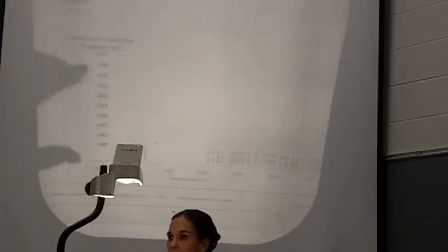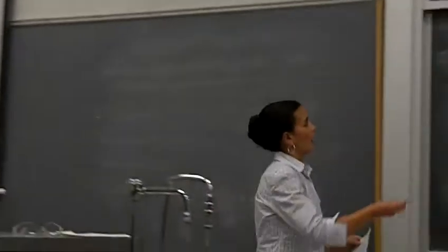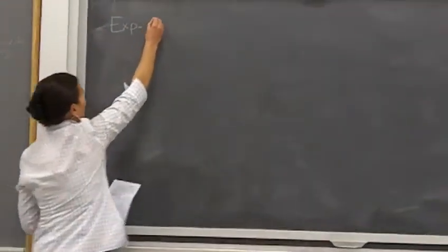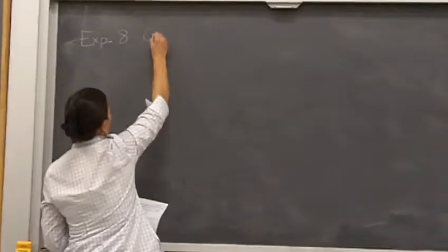So use the peak list for your IR table for comparison, and then compare your IR to what it looks like, but you do not need to print a copy for your report for next week, all right? We all know what it looks like, and everyone would have the same copy, so that's why we don't need it, all right? Okay, so we're gonna start today talking about the Grignard reaction and the Grignard synthesis.